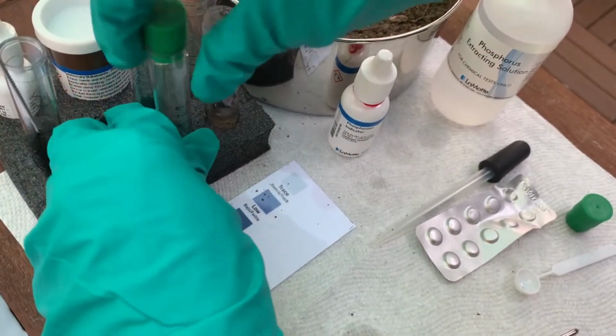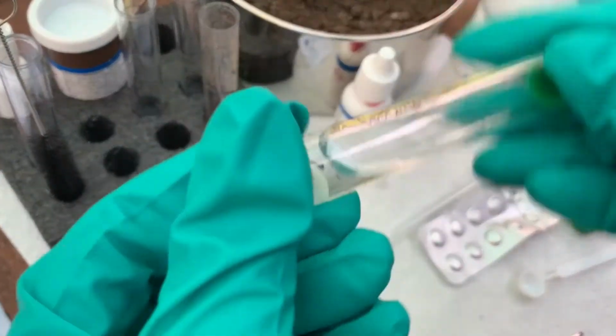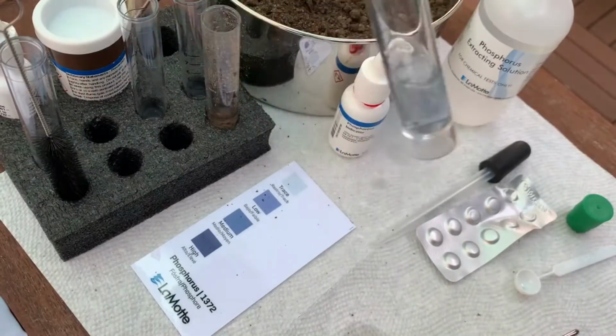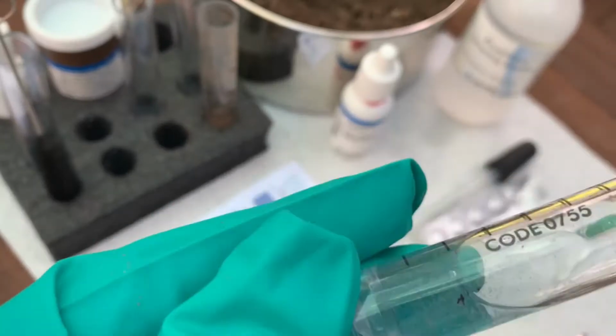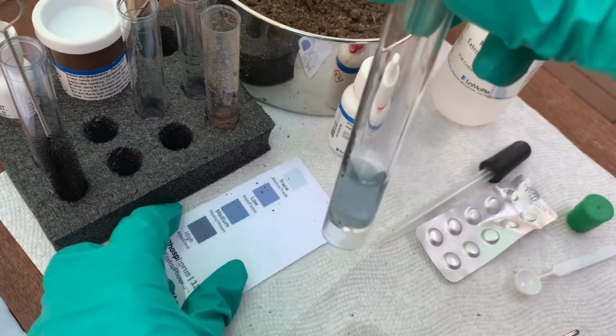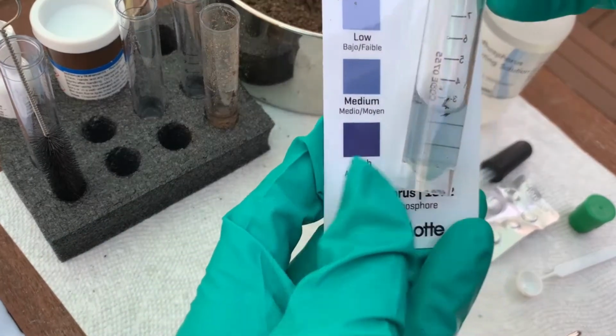And this time we will continue to mix until a blue color develops. And you want to make sure that that tablet is fully dissolved. It may take a little bit of time, and you may need to stop periodically to check and make sure it's fully dissolved.